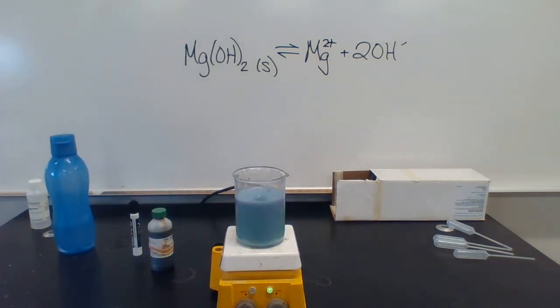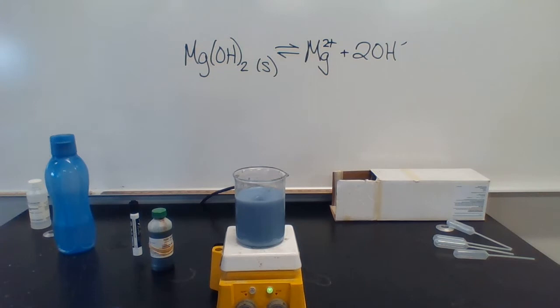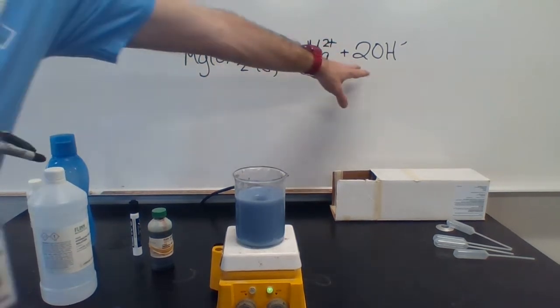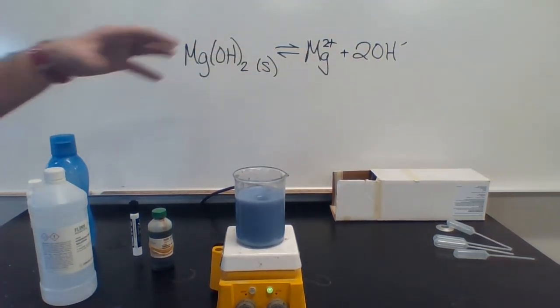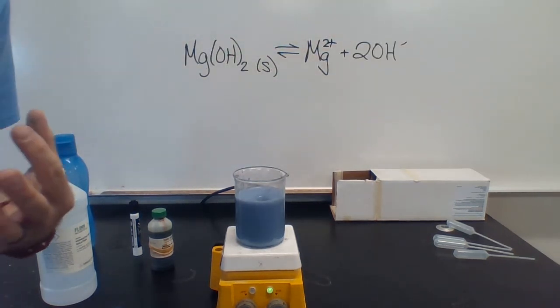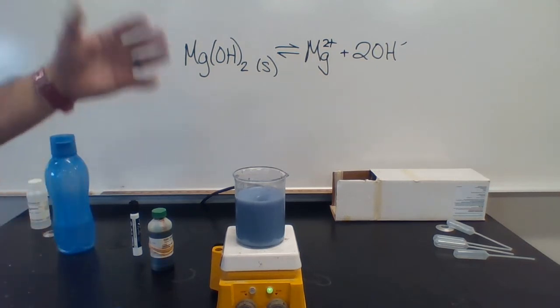So when I put just a little dribble of hydrochloric acid in there, we see a really quick flash of color. It starts off kind of orange, goes yellow to green, but then ultimately we come back to this blue or purple. So if we think about this in terms of the reaction, the acid is neutralizing our base, or our hydroxide. So this is the equivalent of taking away one of our products. When we take away one of our products, the equilibrium has to shift to make that again.